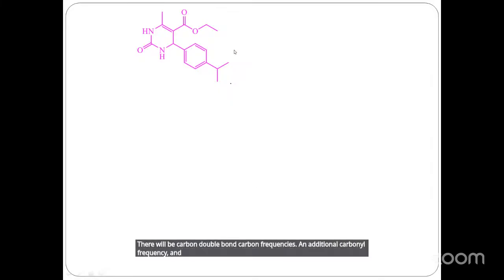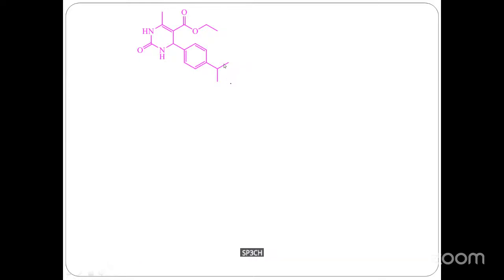It also has sp3 CH. You can see the isopropyl group, ethyl group, CH3, all are sp3. And sp3 CH stretching frequencies are close to 2800.